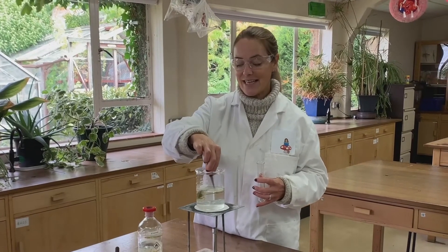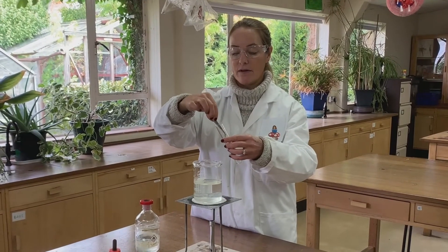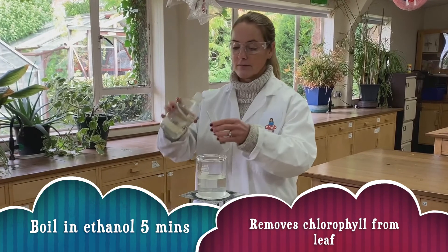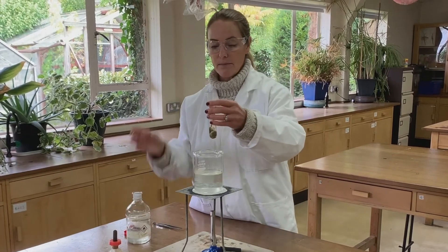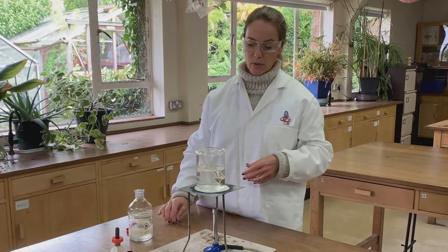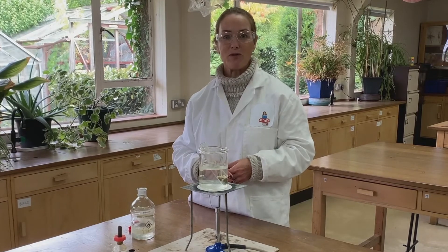We can then take the leaf, put it into the boiling tube, cover it in the ethanol, and put it back into the water. You should be able to see it starting to boil. We're now going to leave that for about five minutes because it takes that long for the ethanol to remove the chlorophyll from the cells.